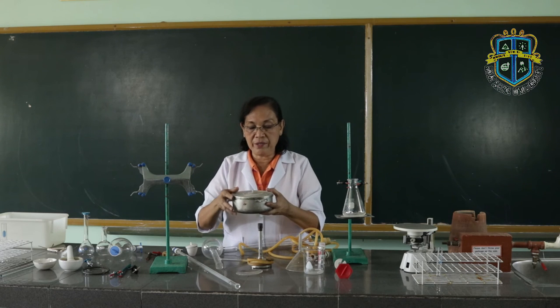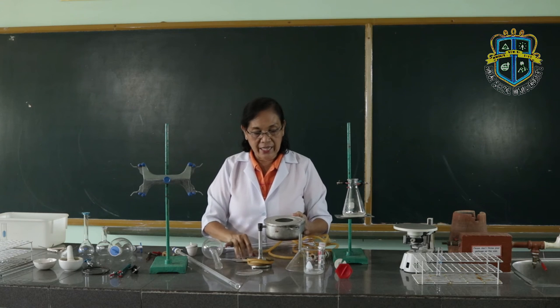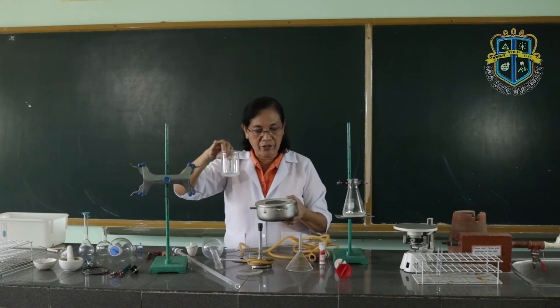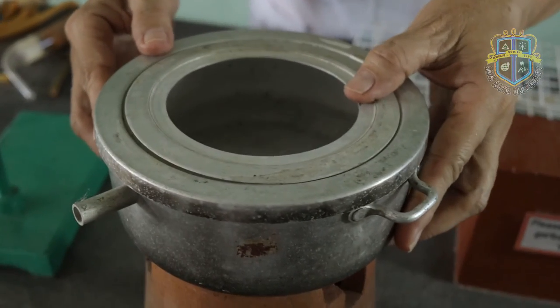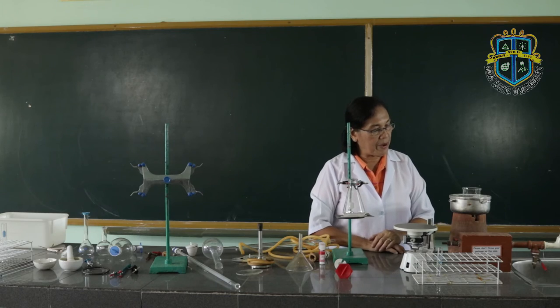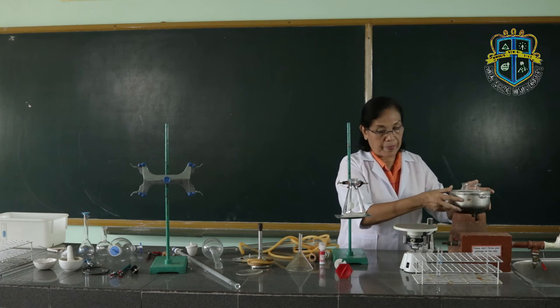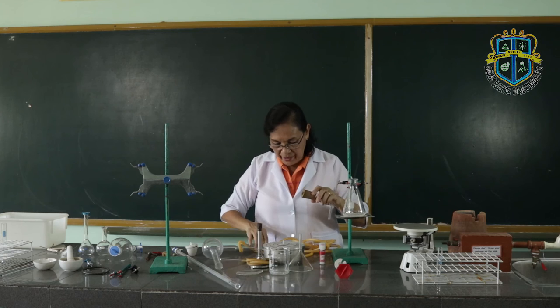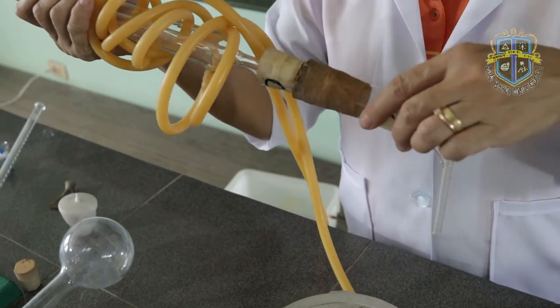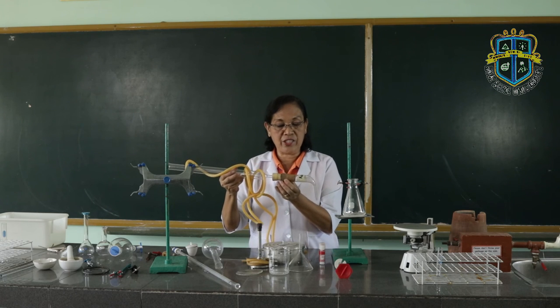This is what we call the water bath. Gentle heating requires a water bath. When you need to heat a liquid inside a beaker without heating it directly, you place it into the water bath. Then we have the adapter. The adapter works together with the condenser and is inserted at the tip of the condenser to collect the distillate — the substance that results from distillation.